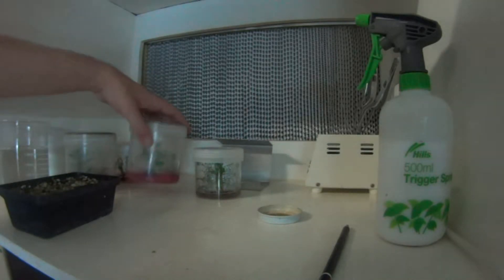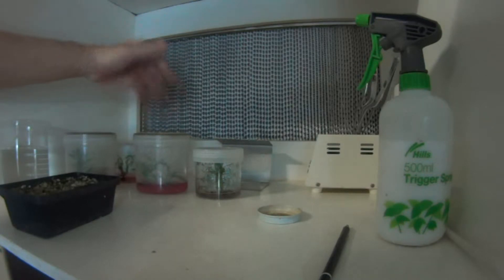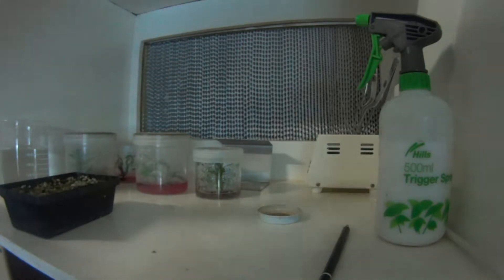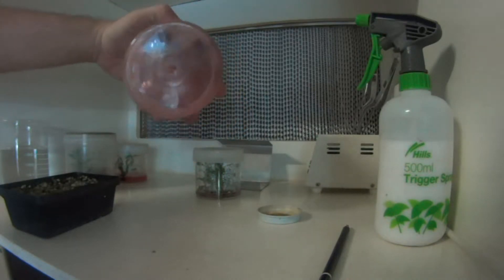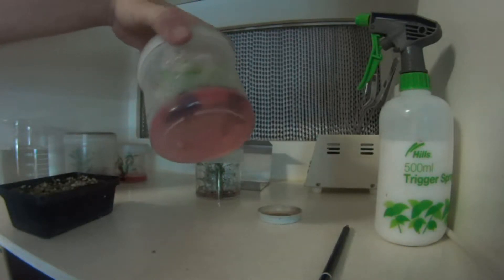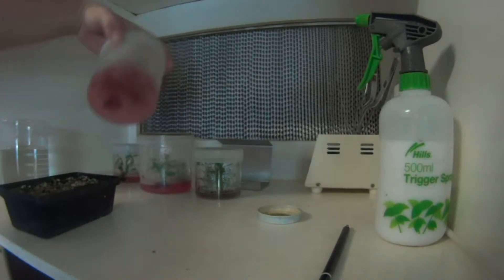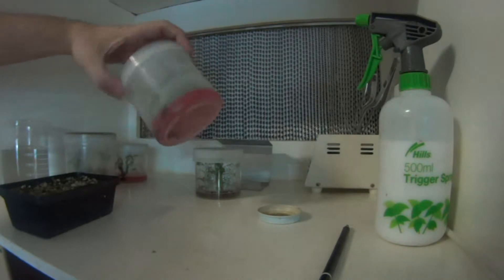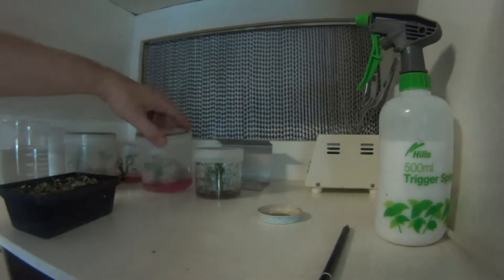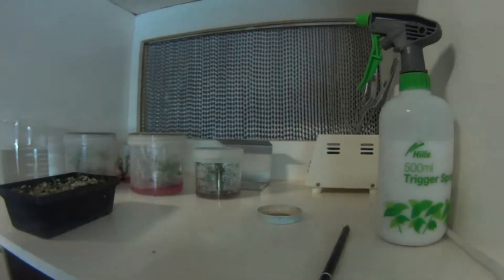I thought I'd make a video on how I go about hardening the plants off, or start hardening off anyway. Whether you can see or not, these plants have developed a decent amount of roots on them. I've actually removed a couple of plants out of here that didn't have roots on them and placed them in fresh media before I did this, so that's why there's only a couple in there. I thought I'd just show you how to do it and give you a basic idea of what goes on.